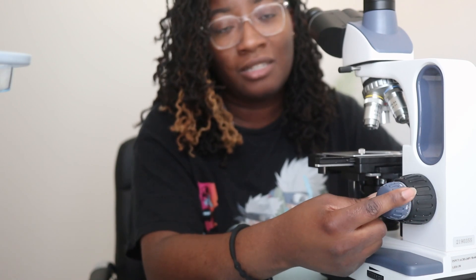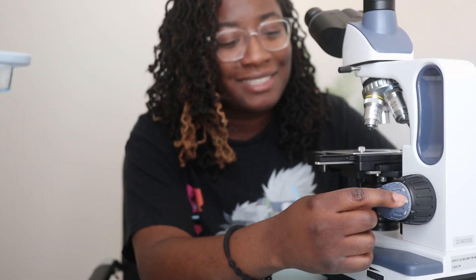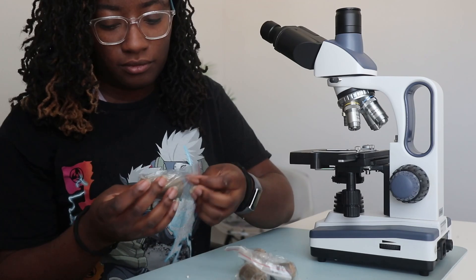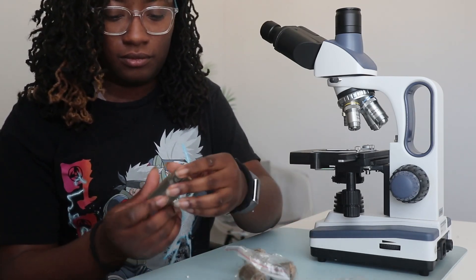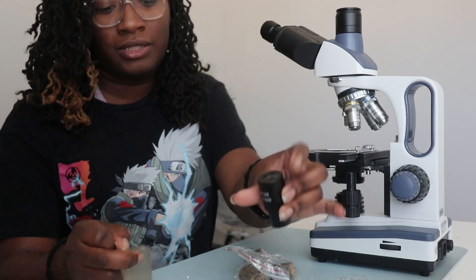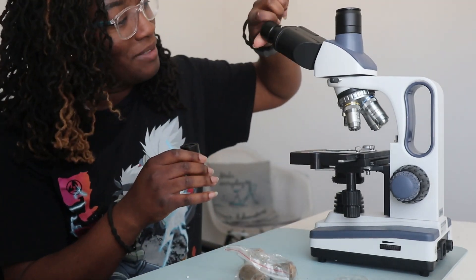I'm so used to having literal knobs for my coarse and fine adjustments — I've never had dials. I hope that they are precise. We have all of our ocular lenses. We got a wide field 10x, wide field 10x. I'm just going to put it on — I don't want to put it on the table.